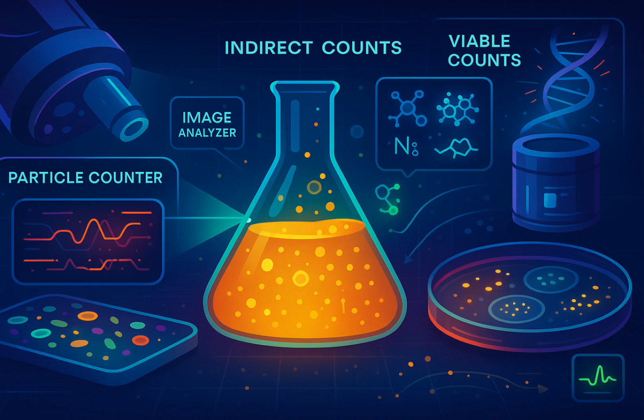You can measure this on different scales: absorbance, percent transmittance, sometimes Klett units. You can convert between A and percent T, but consistency is key. Does the color of light you use matter? Like red light versus blue light? It does. Shorter wavelengths, blue light, get scattered more effectively, so it's more sensitive for low cell numbers. But that nonlinear problem starts happening sooner, at lower concentrations. Longer wavelengths, red light, are less sensitive overall, but they often give you a more linear relationship over a wider range of cell densities. That's often better if you're tracking a whole growth curve.